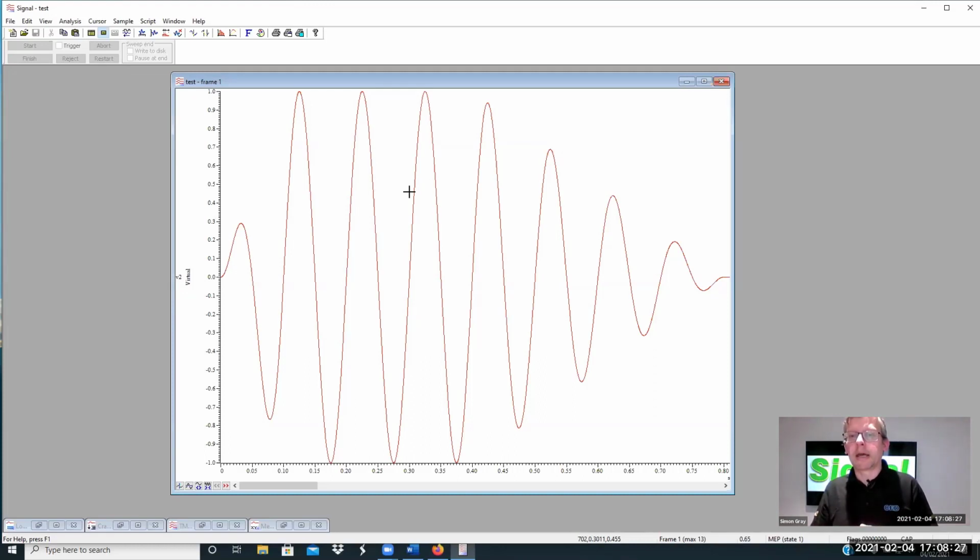The amplifier may be hit hard by the TMS pulse, and you get this sort of ringing, and it can go on and swamp your response. And that's rather difficult to get rid of. If you simply had a large stimulus response you wanted to cut out or subdue, we could smooth it, we could use a median filter, etc., to hopefully reduce it.